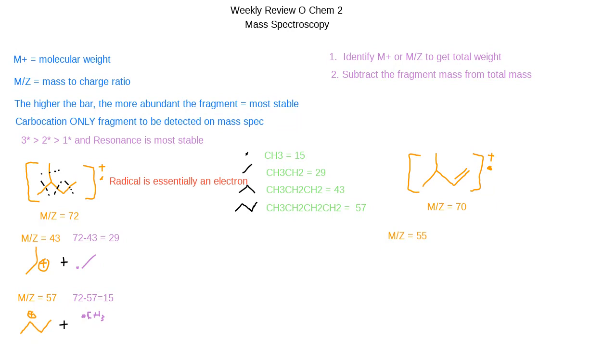All right, so, of course, we are going to do the math again. 70 minus 55 equals 15. Okay, that works in our favor because, as we already know, 15 equals a methyl group, and this time I only have 2 options, and really it's only one option because either way it's the same thing. I can only cut right here, or I can cut right here.